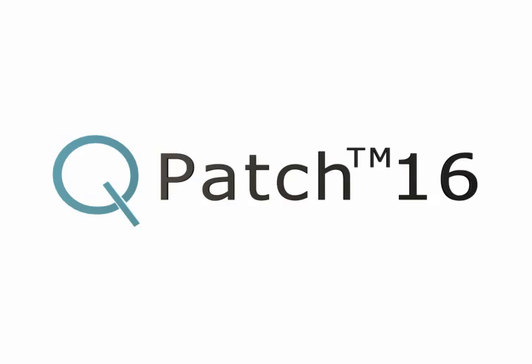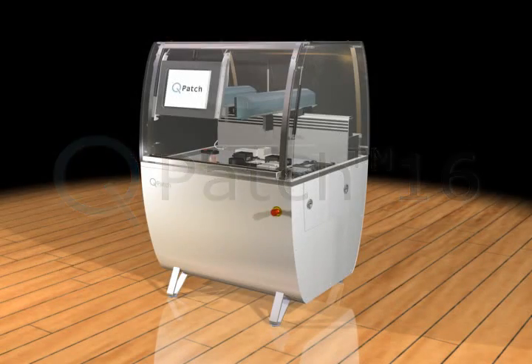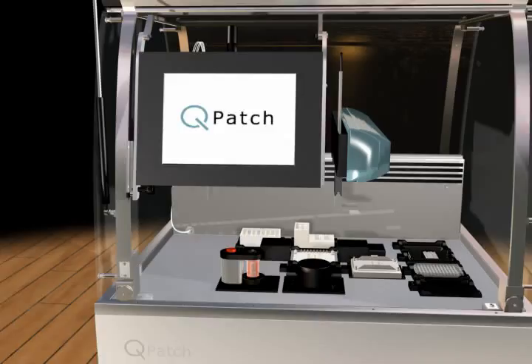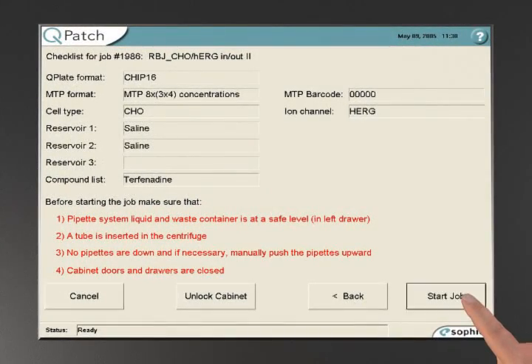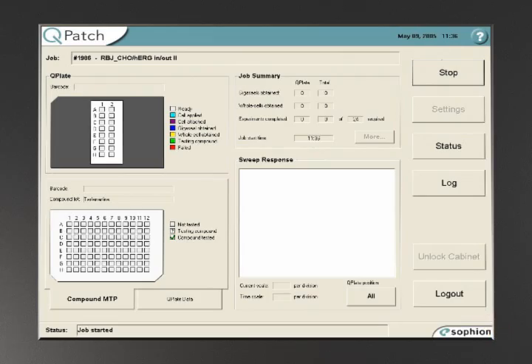The Q-Patch is a 16-channel automated patch clamp system for ion channel screening. Following Q-Patch setup, a simple click on the touchscreen starts the experiment.